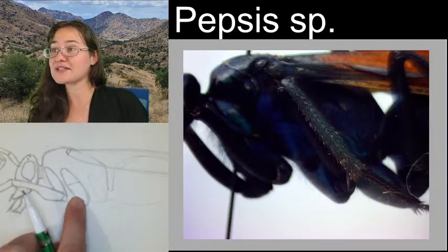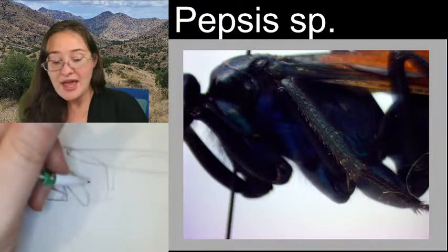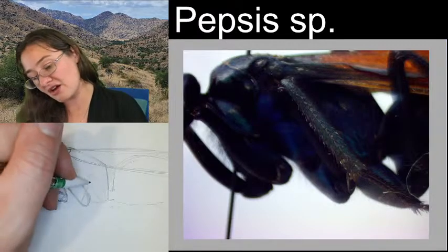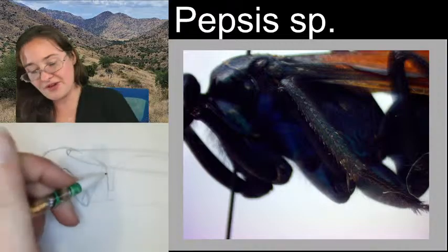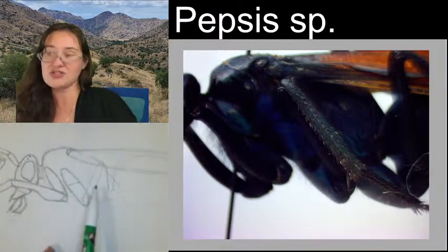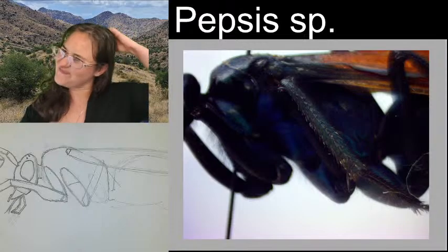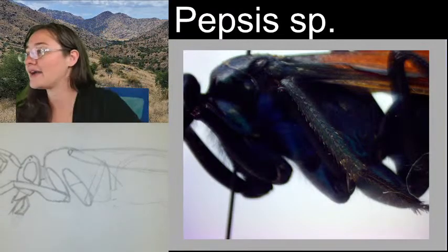All right, so our coxa comes down, our femur comes up, and then our tibia comes out. And really, on this specimen, the femur and the tibia are very similar to one another. I'm actually going to divide it just a little bit so that you can see the individual pieces, because I tucked it up like this, and I want to pull it back.